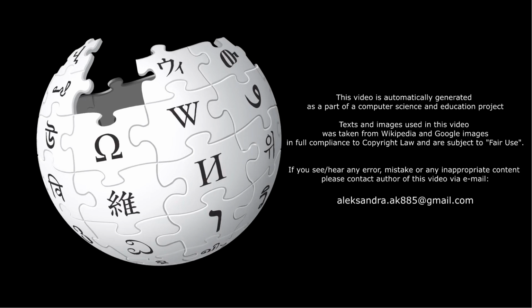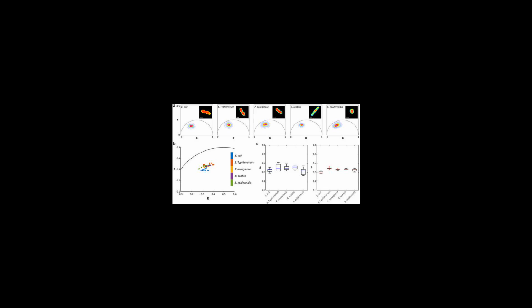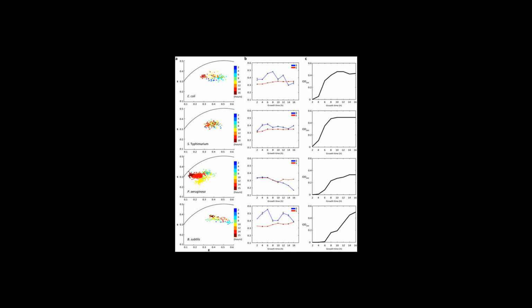TCSPC, time-correlated single photon counting. TCSPC is usually employed because it compensates for variations in source intensity and single photon pulse amplitudes. Using commercial TCSPC equipment, a fluorescence decay curve can be recorded with a time resolution down to 405 fs. The recorded fluorescence decay histogram obeys Poisson statistics, which is considered in determining goodness of fit during fitting.